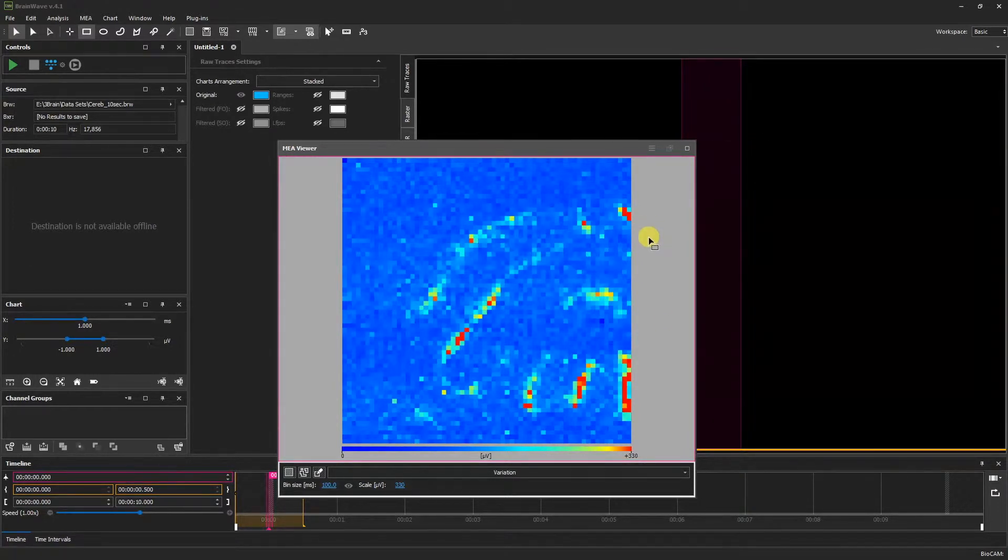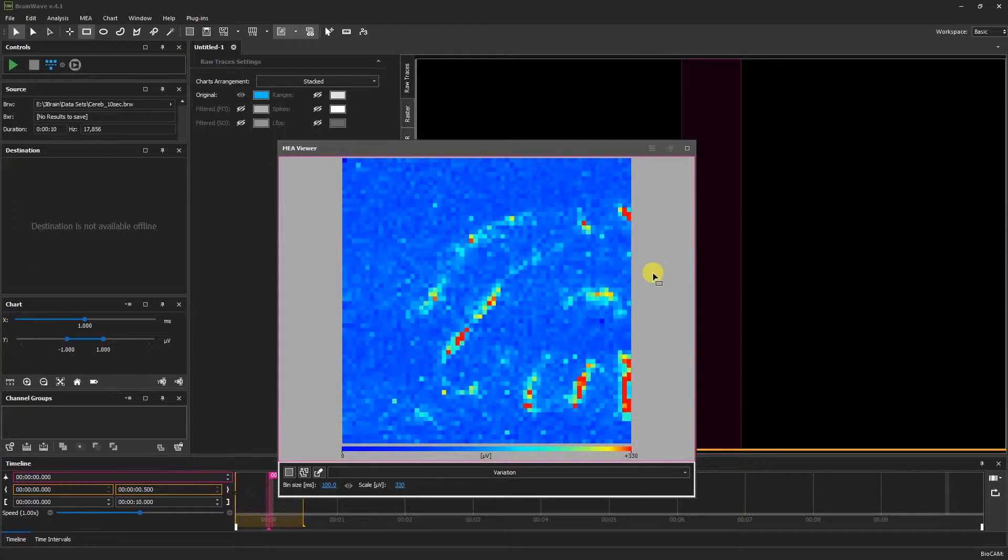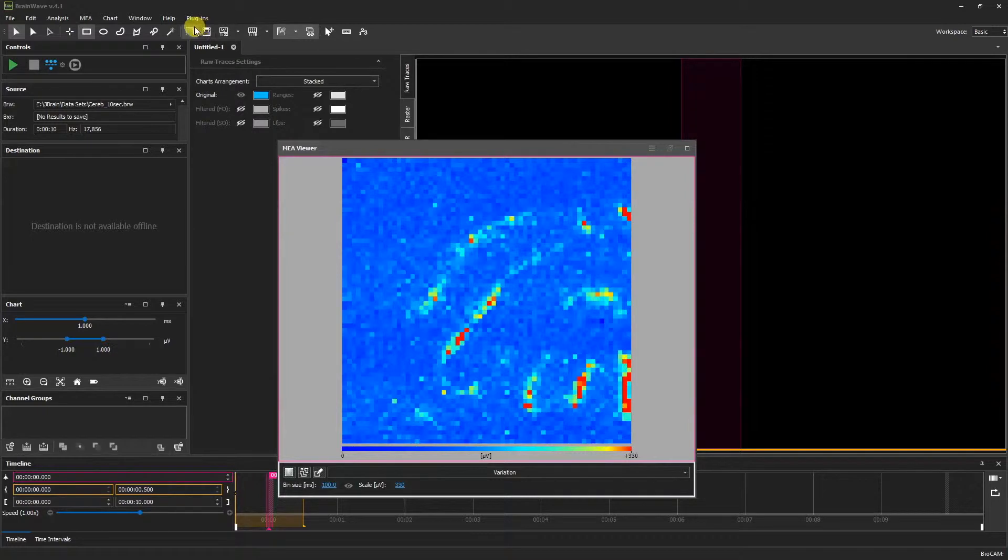Clicking anywhere on the MEA Viewer boundaries will clear our selection. In addition to the default rectangular selection tool, we have a variety of other tools available. Now let's return to the full selection mode.